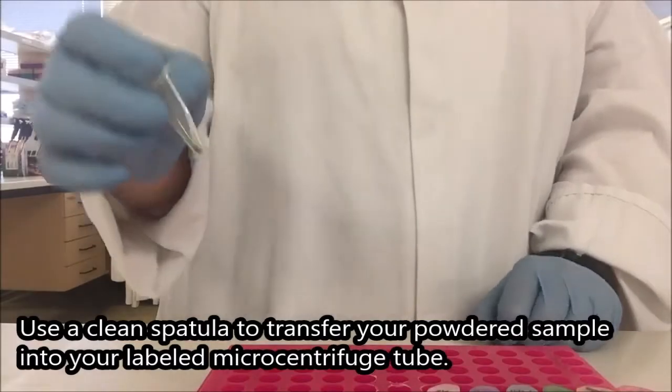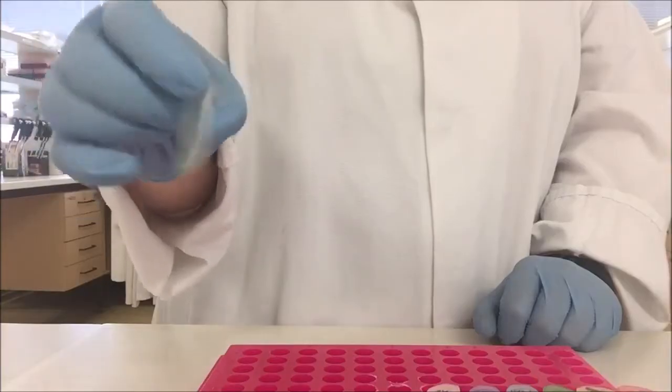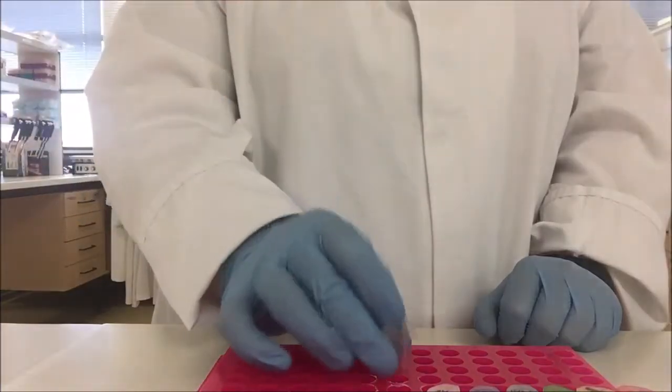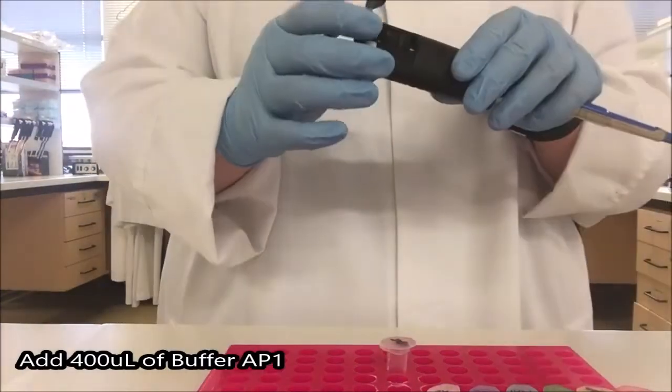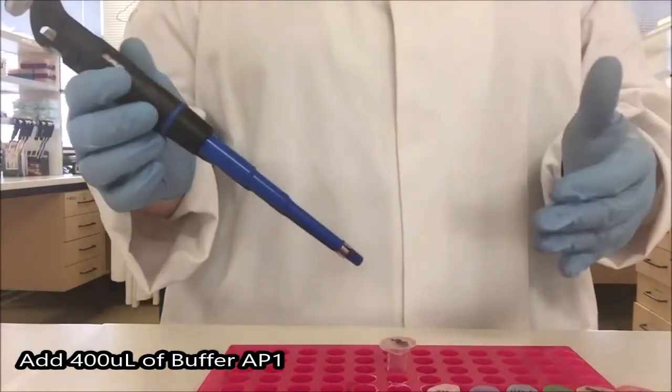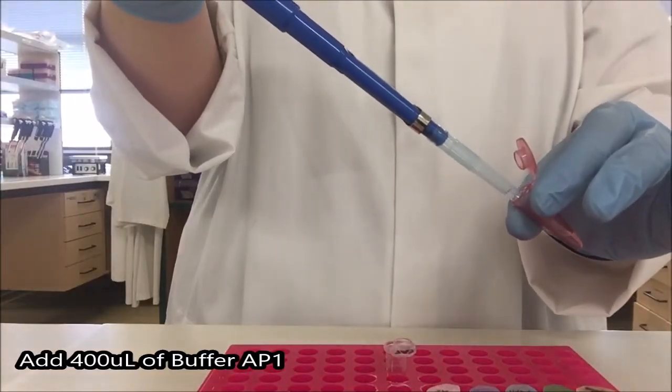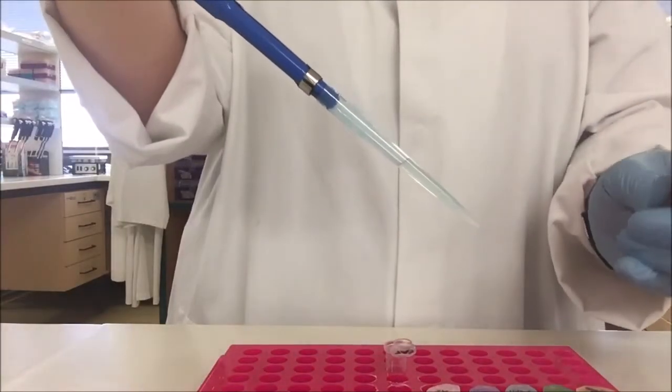Now I've disrupted my tissue sample and have a small amount of dry, crushed leaf material in my labeled microcentrifuge tube. Now I'm going to add 400 microliters of AP1. I'm using the blue pipette set to 040 or 0.4 of a mil. Pipette up slowly so that I don't get any splashing within my pipette tip.